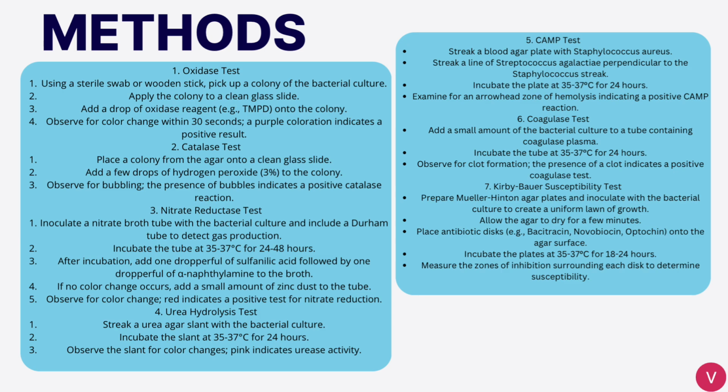For the urea hydrolysis test, we streaked a urea agar slant with the bacterial culture. We incubated this slant at 35 to 37 degrees Celsius for 24 hours and we observed it for color changes, with pink indicating urease activity.